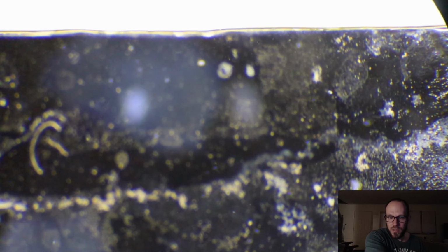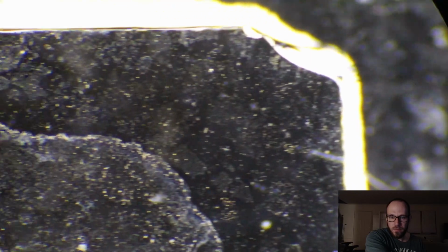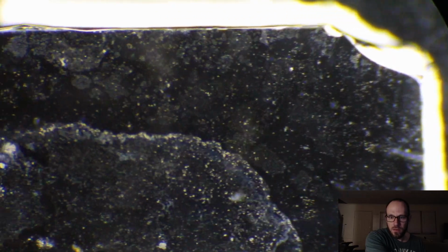Very cool. Very cool. But yeah, very distracting. There's another one, and there's a wacky little Paramecium, I think. And this is where the thing got chipped.